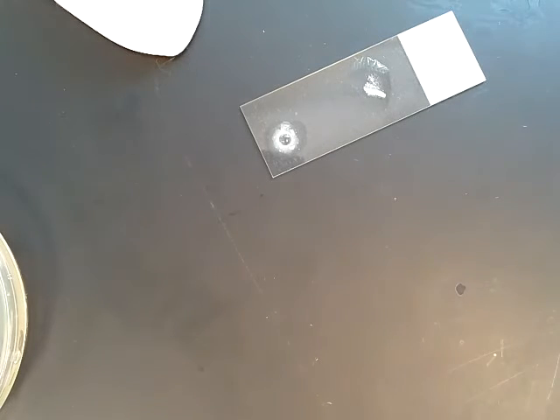Catalase positive means that the microorganism produces catalase. When catalase is present, it's going to break down that hydrogen peroxide to release gas, and that's why you're seeing the bubbles start to form. It's because gas is being released when hydrogen peroxide is digested by that catalase enzyme. This gives you immediate results, and you can record those results as positive for both of these samples.